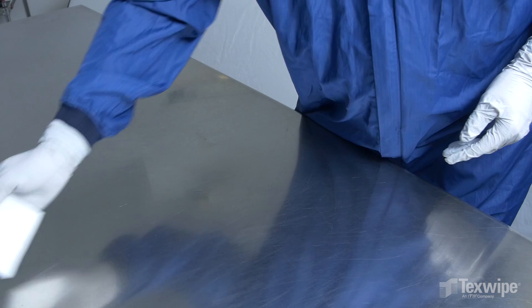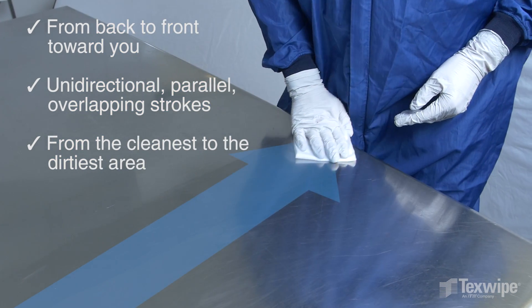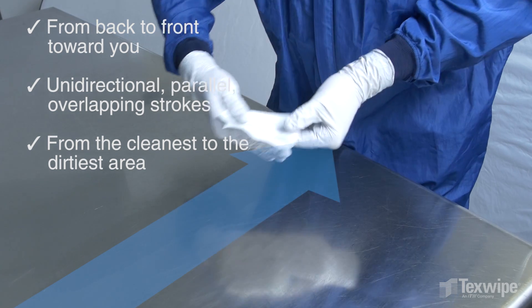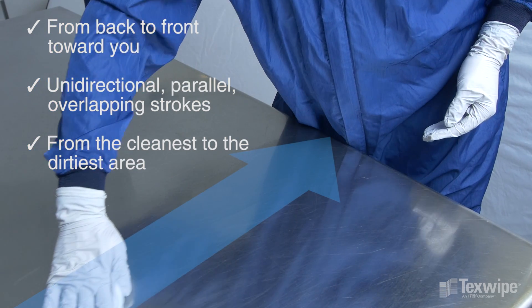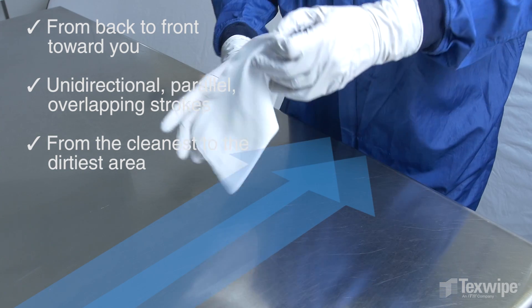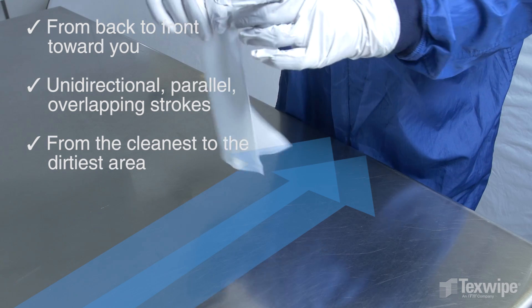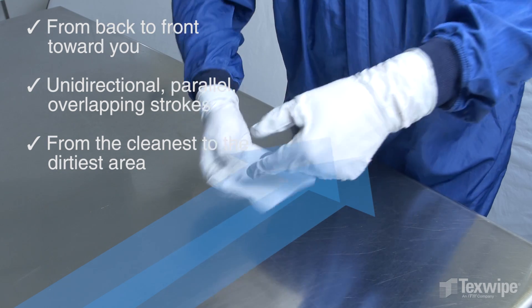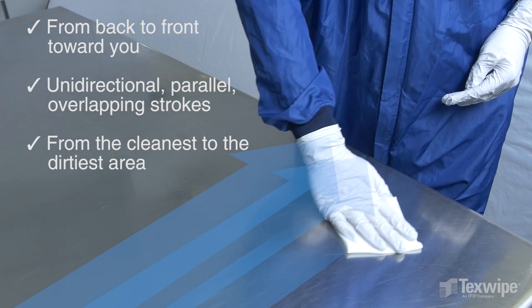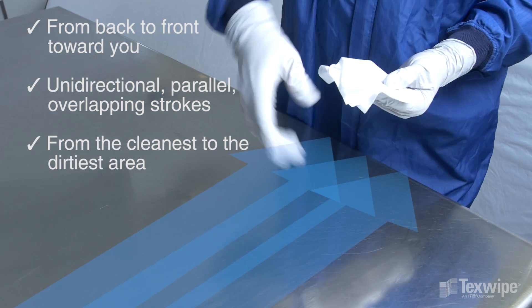Another technique is to wipe from back to front toward you with the same unidirectional, parallel, overlapping strokes. Always wipe from the cleanest to the dirtiest area. The strokes should progress across the work surface in one direction. Start a new stroke with a refolded wiper. After using all sides of the wiper, discard it according to the SOP.